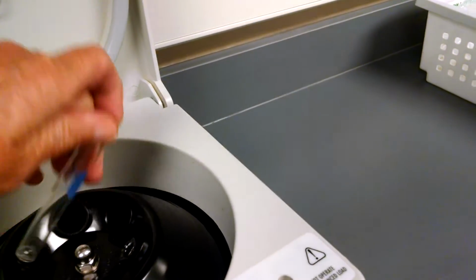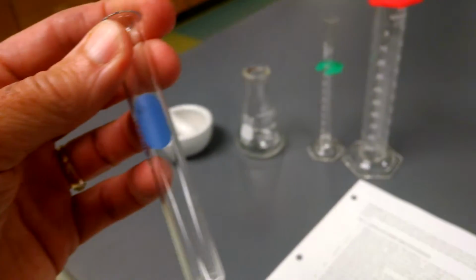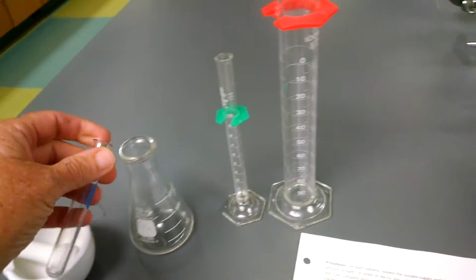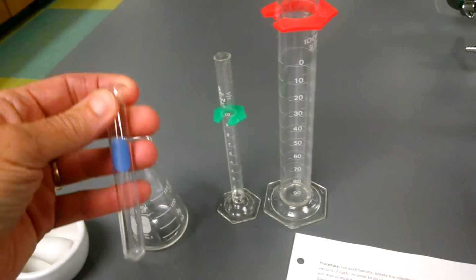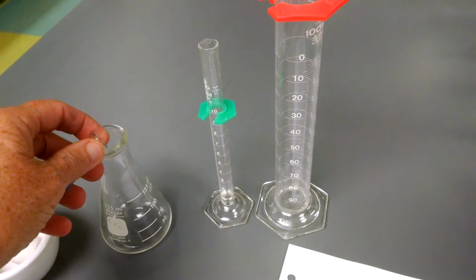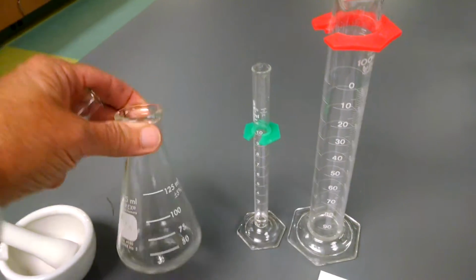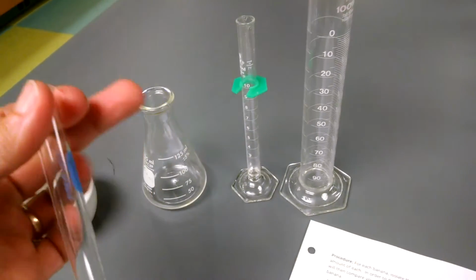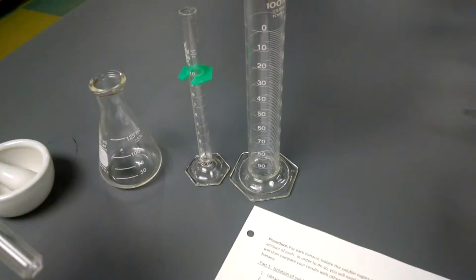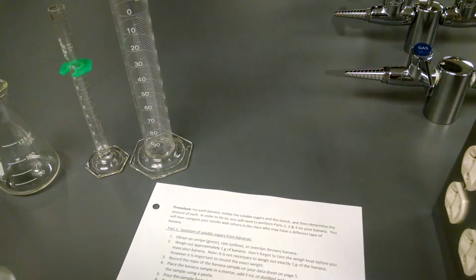Okay, so now you've got this here, and it's got 2 parts. It's got a liquid part, it's got a solid part. You're actually going to go through another process. The liquid goes in here, you centrifuge it again, more liquid goes in here. This is your glucose. It's in the liquid. The sugar part's in the liquid. You've got the solid part of the banana, and what you're going to do with that solid part is try to isolate it a little bit further and dry it out.